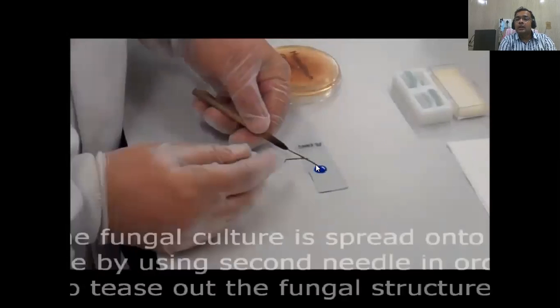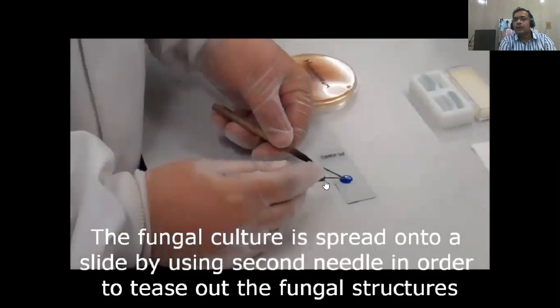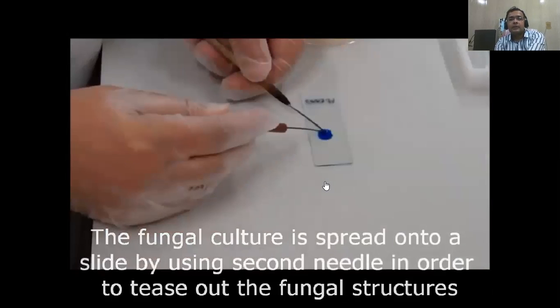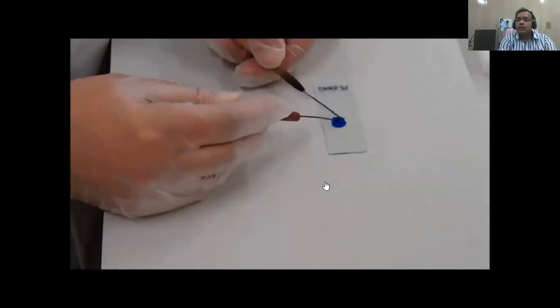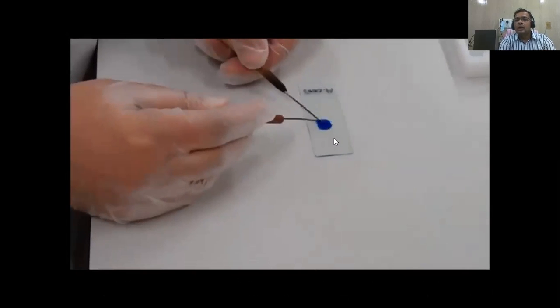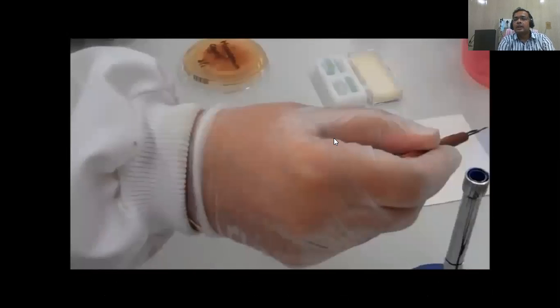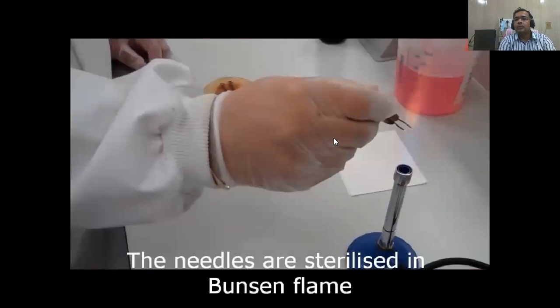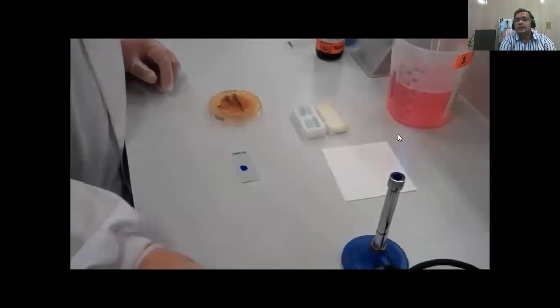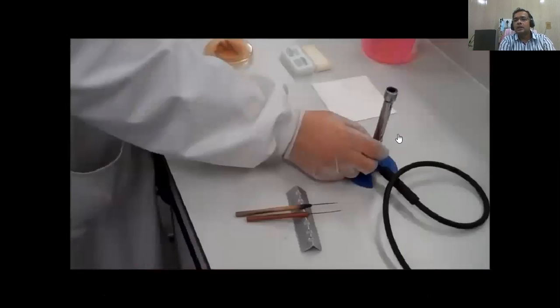Now with the other needle, you have to scrape out all the culture that we are taking. After taking this, you have to mix it over the lactophenol cotton blue. Once you mix it, everything gets separated and you get a uniform thickness. Before this, you have to sterilize your needle so that it can be reused.